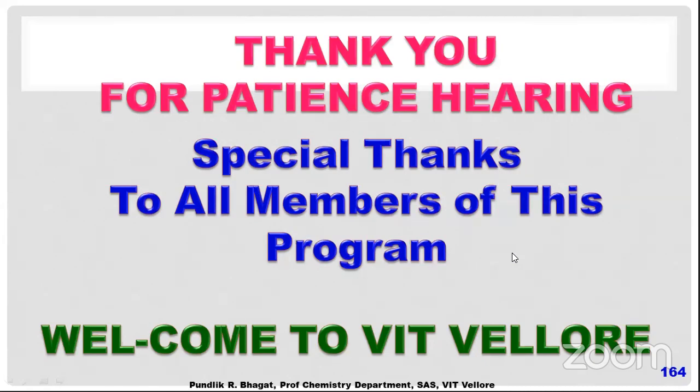No issues, sir. You can search about the isosbestic point. You see lambda max again by changing pH. Then you will come to know at which pH you are getting the isosbestic point, and then you can select that while determining lambda max.